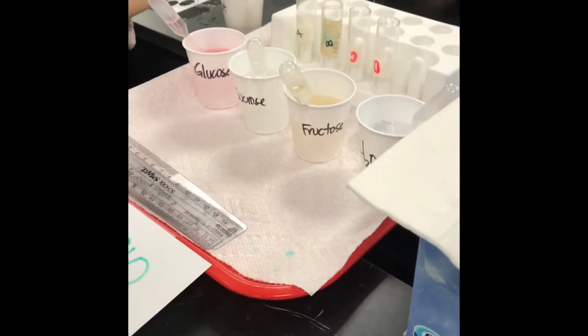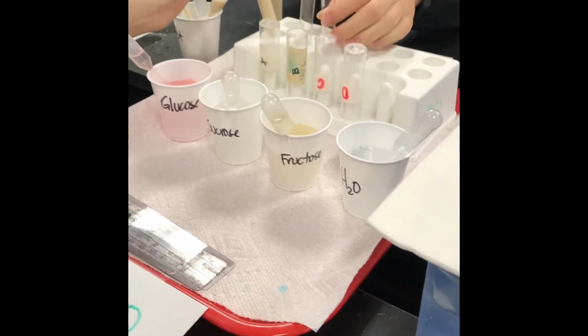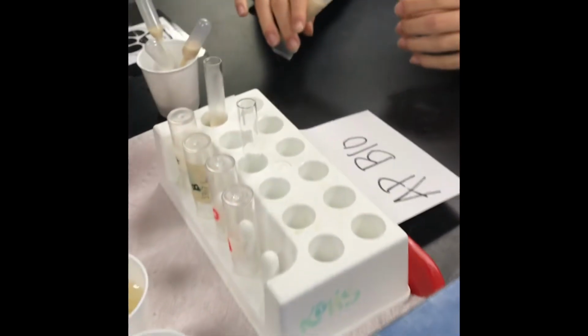All right, so we're starting the Yeast Fermentation Lab. As you can see, we have a setup. This group is doing a great job. They're measuring out 5 milliliters of yeast, and they're putting them in their 4 tubes. So they've got glass tubes, as you can see right there.